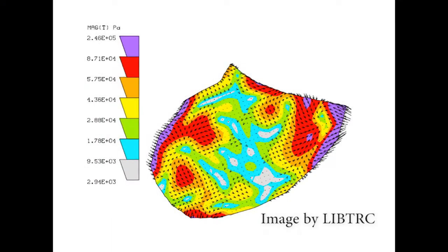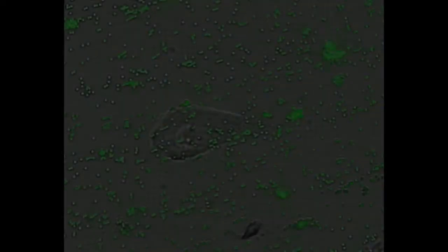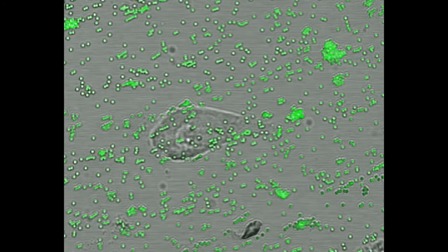We then seed cardiomyocytes onto the gels and image contracting cells. Through image analysis, we can quantify the contraction stress of each cell.